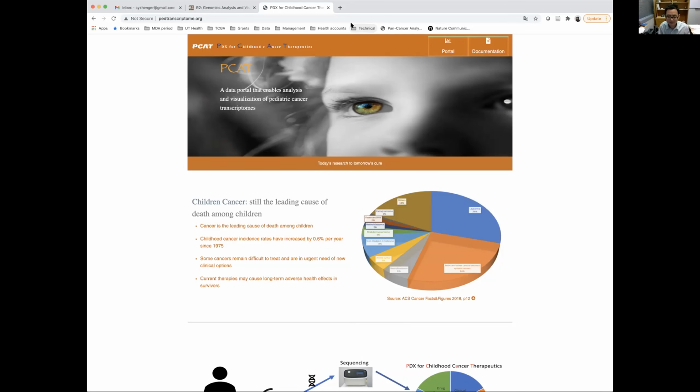And PacBio, they have been running their platform for quite some time now, right? But it's still good mainly for microbial genomes. It's still not good for humans, because you get much longer reads for microbiomes than for humans. For humans the average read length is several K. For the microbiome, it would be really good, and you have millions of base pairs, but you only get like 20K or 30K on average for the human genome.